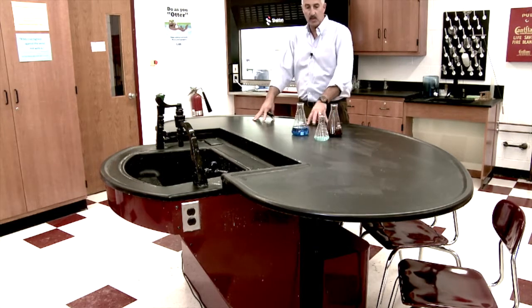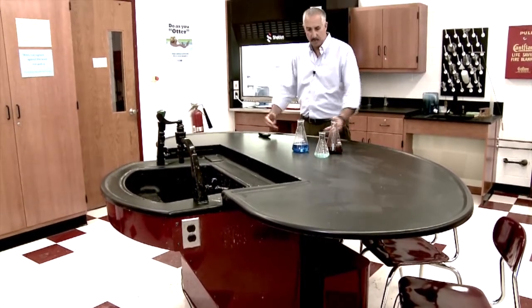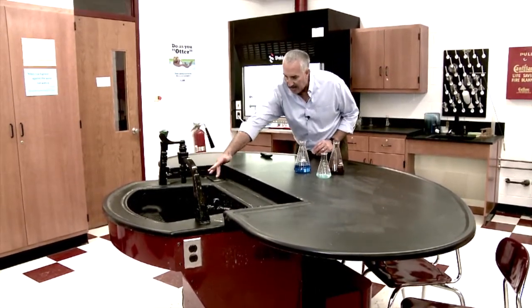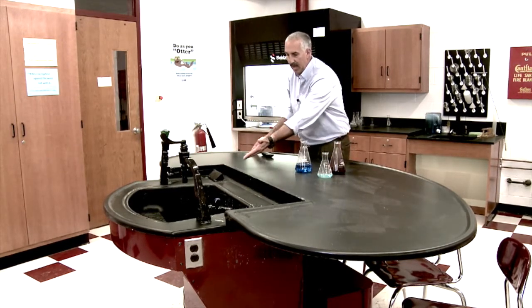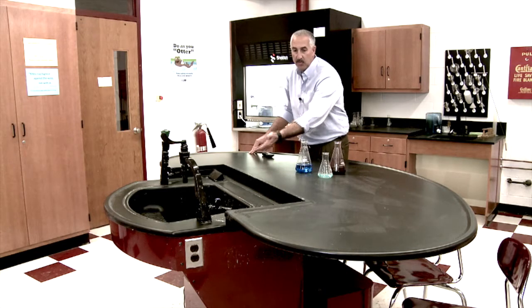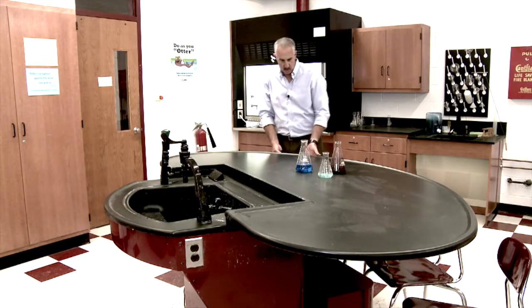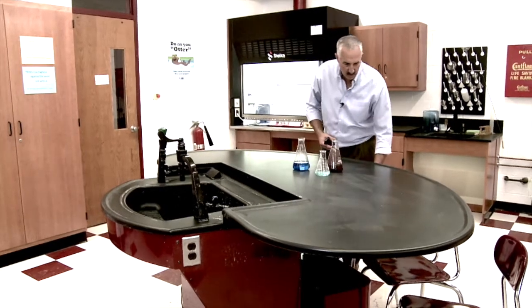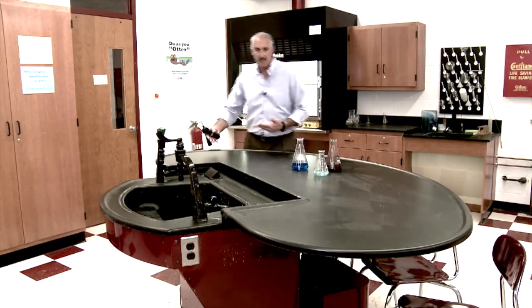Now we're standing and doing our lab experiments, and again, with a marine edge all the way around the perimeter, there's no spillage. We have our electrical and data flip-ups — we could have up to four electrical on each side, or a combination of either or. And as you see, your standard 18-inch high chair easily fits underneath the unit, out of the way of the student, giving you a lot of flow within the room.